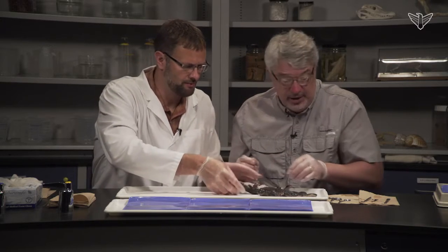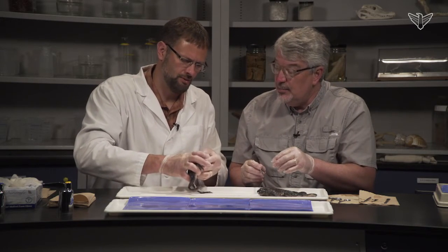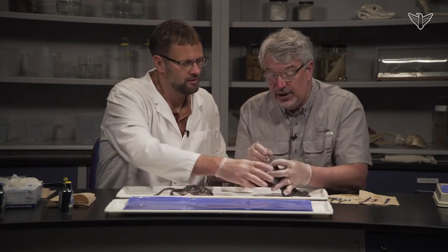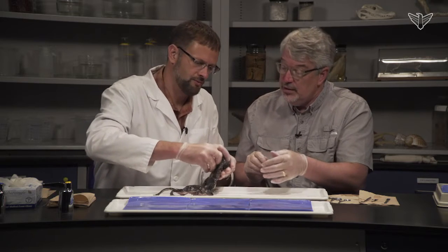We can try to open that up a little bit. We can get the mouth structure. Maybe not this one. This one's a little easier to open. Yeah, let's try that one again. There he goes. Alrighty, I'll open this one up for you.